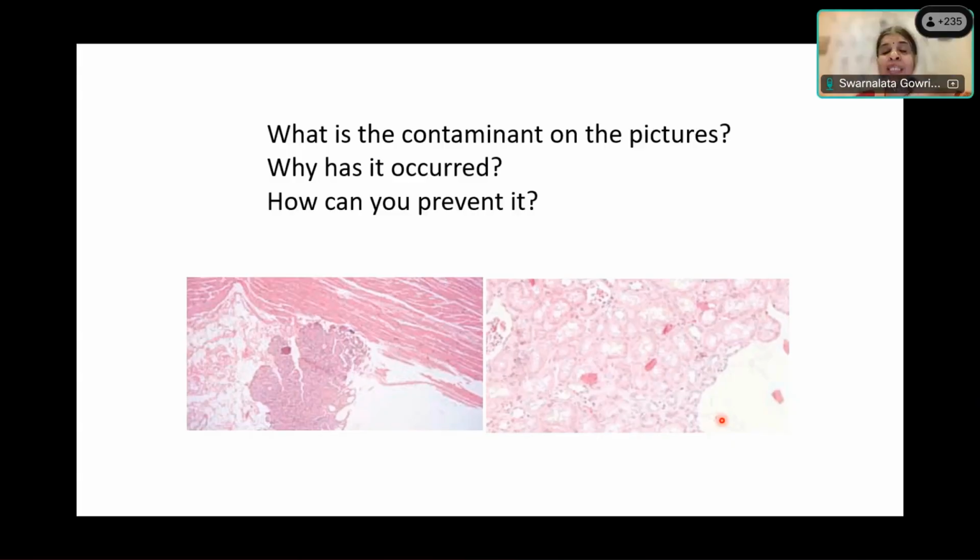When you cough or sneeze, I'll show you the next one. That will be even more. But here it's usually, especially hands. When you pick up a slide, very important to tell your technicians, handle the slide from the edges. Don't put your hand in the center, because you don't realize how millions of squamous cells are being shed off from your hand and they will just get onto the slide. Okay, very important that they clean the slide and it is handled by the edges.